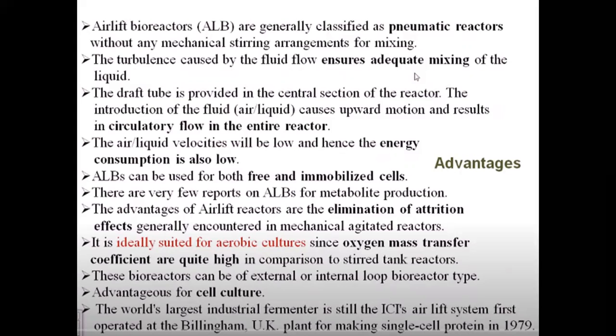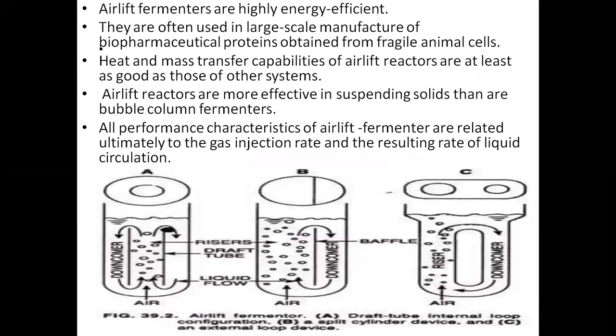The airlift bioreactors can be used for both free and immobilized cells, and there are very few reports on ALB for metabolic production. The advantages of this type of reactor are the elimination of attrition effects, and it is ideally suited for aerobic cultures since oxygen mass transfer coefficients are quite high in comparison to stirred tank reactors.